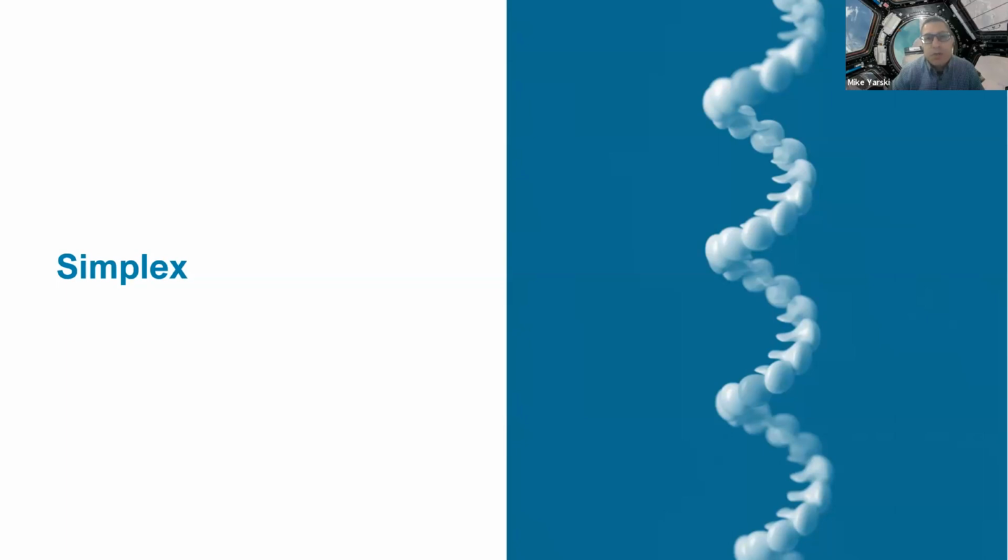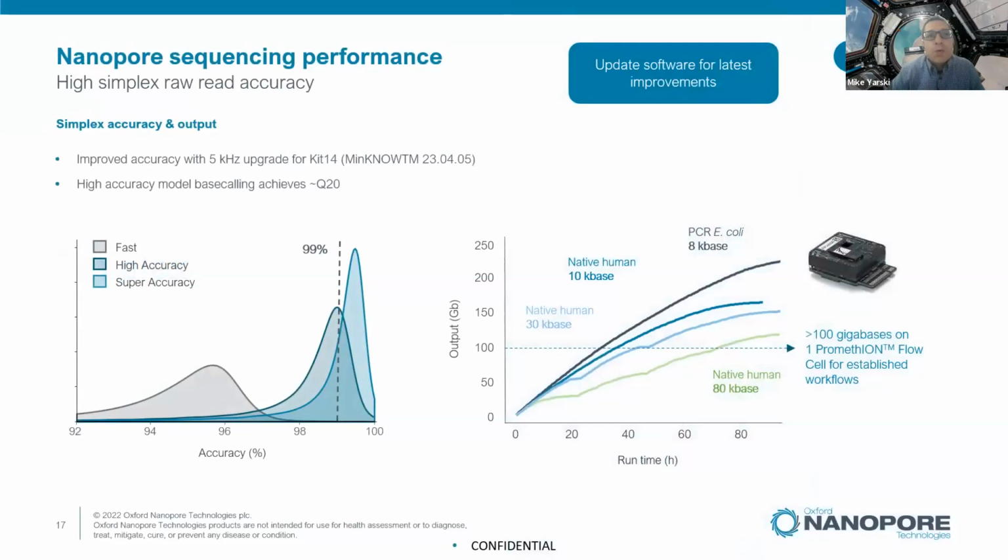Warren already touched on some of these. I will talk about the simplex just here, and Warren mentioned this right here, is that basically how you prepare your library will affect the output. And then this is going to lead mostly into the main points that I'm going to make today for my talk. Now I'm going to set a timer to make sure I don't go over time.